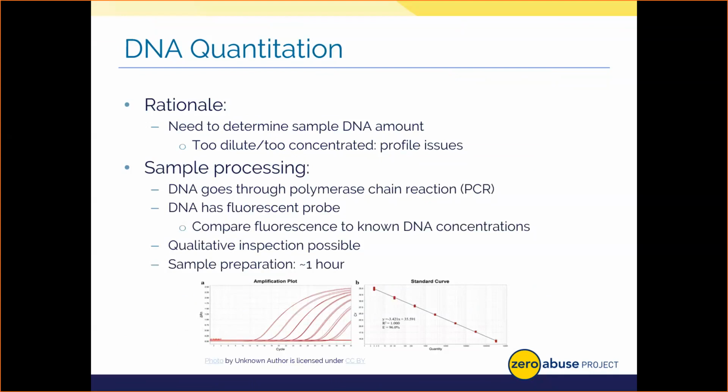Conversely, if I use too much DNA, we end up amplifying parts of the DNA we aren't targeting in our chemistries, or we simply oversaturate our chemicals and use them all up in our DNA kits. And that results in no DNA being copied for profile generation. And when we generate the profile, the amount of DNA can also cause issues. It can cause excess light or signal buildup, and it basically blinds the DNA interpretation instrument, which can lead to, again, an unusable profile. Armed with this knowledge, let's go ahead and talk about quantitation.